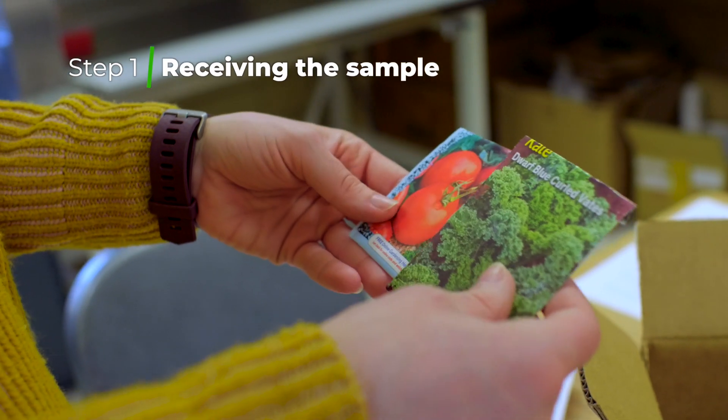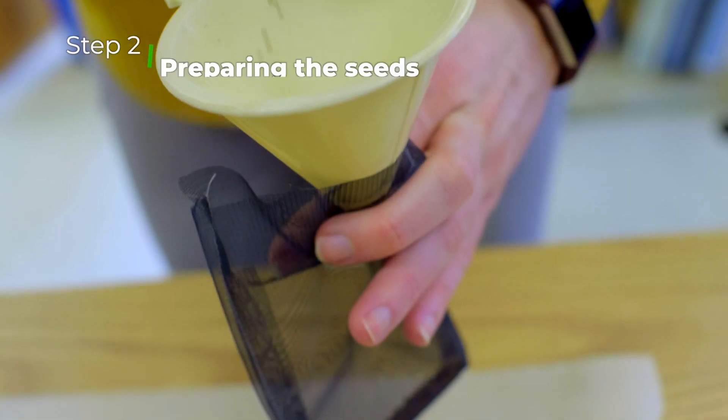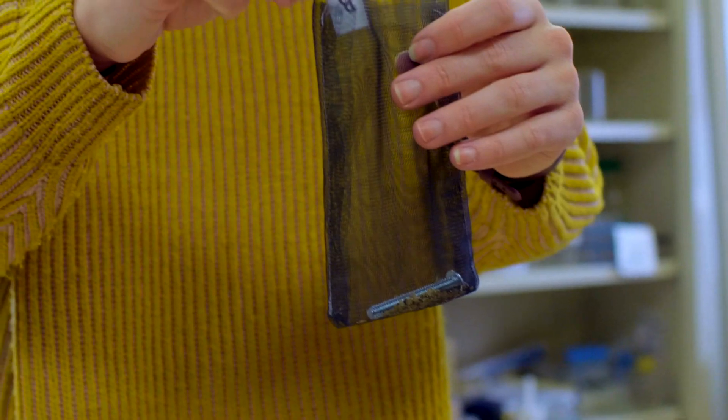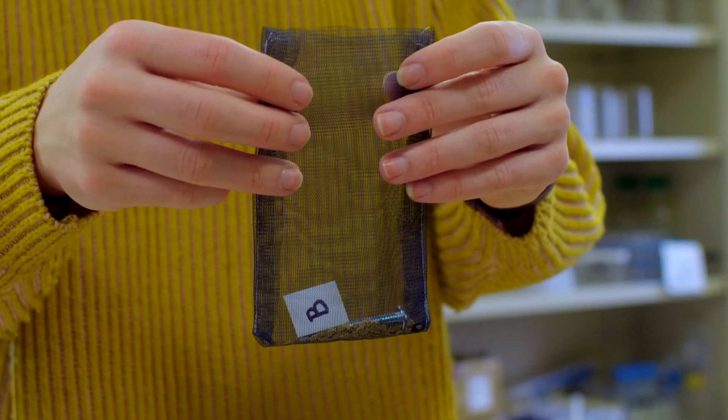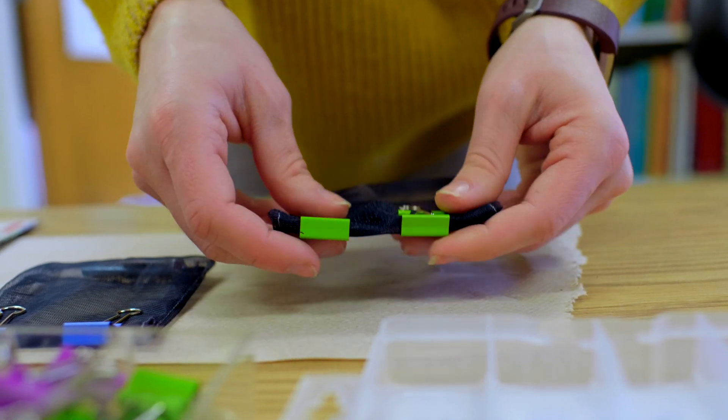When we first receive the seeds, we log the sample into our database and assign it a unique code. We then place the seeds in a fine mesh treatment bag, and the seeds are carefully kept separate based on the crop and variety. Treatment bags are ID tagged and color-coded for quality assurance.